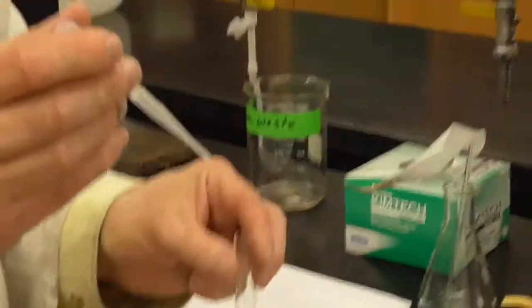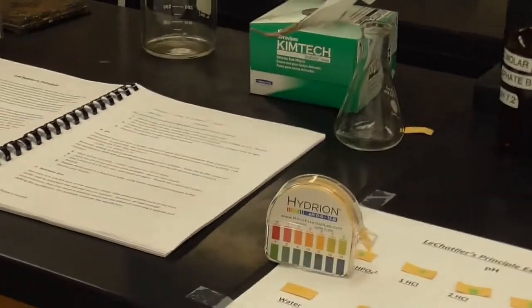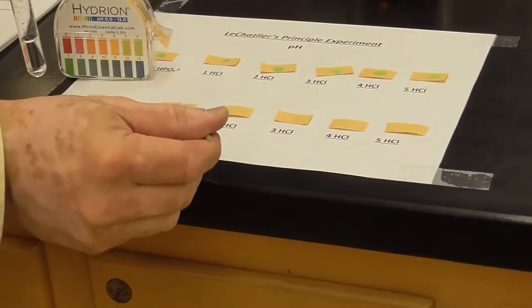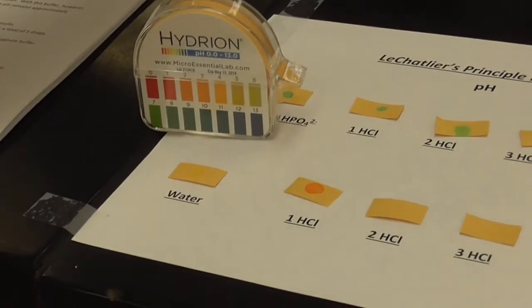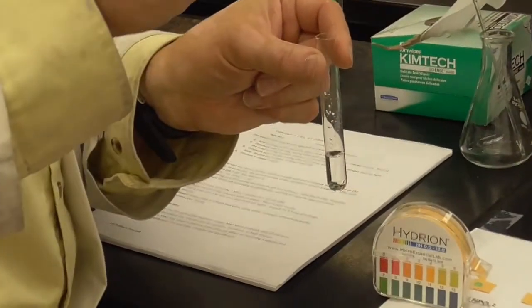Now let's go ahead and add hydrochloric acid like before, drop by drop. So here's the 1st drop going in. Good. Mix it up. And look at that. A bigger drop. I can't get it to stick. Let's try that again. There we go. I think I got it. There we go. There's 1 drop. Put the 2nd drop in. There's air bubbles. I'm going to get them out of the way. 2 drops.